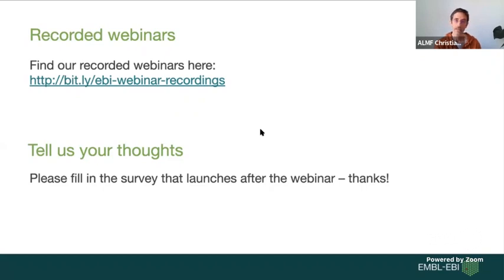Also in CellProfiler, if you download the latest version, you can do 3D. The problem there is a little bit that the visualization in 3D is not so good. So it's a bit hard to inspect the images at the moment, but you still can do it. Otherwise, we also use commercial software for this if it's big 3D data, because 3D visualization is not so easy. So we use commercial software like Imaris or something like that. So I think that would be my answer.